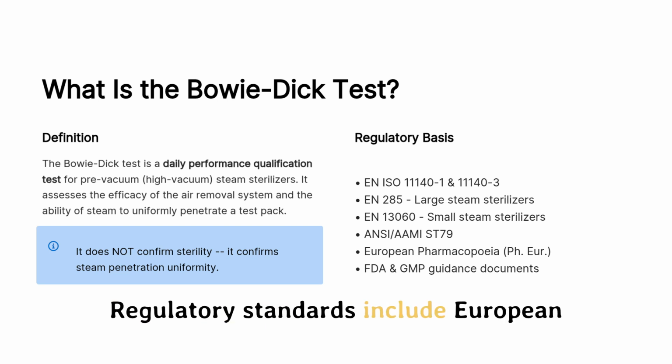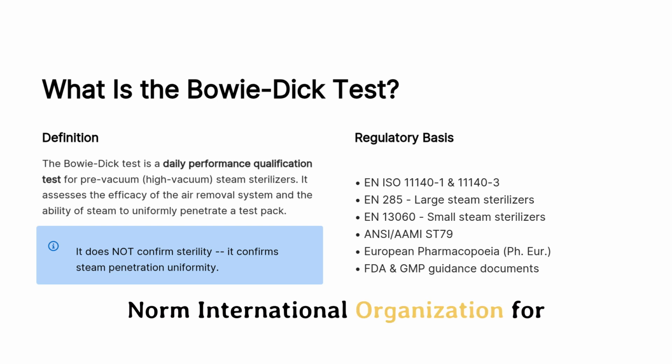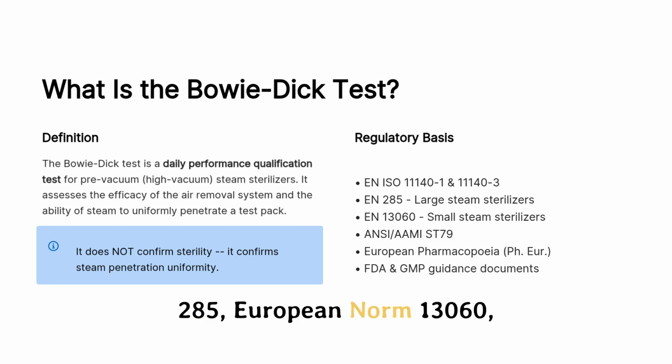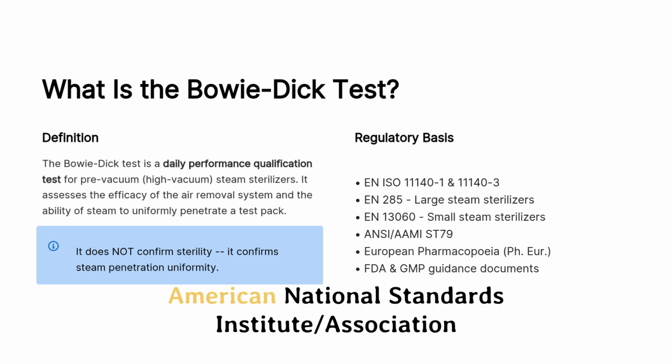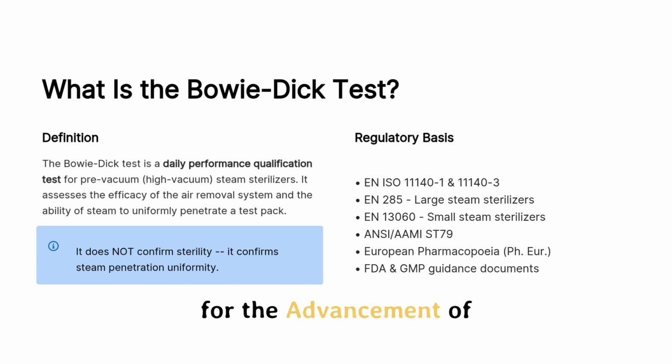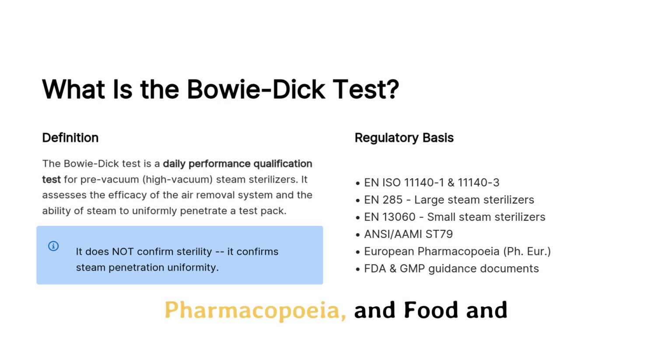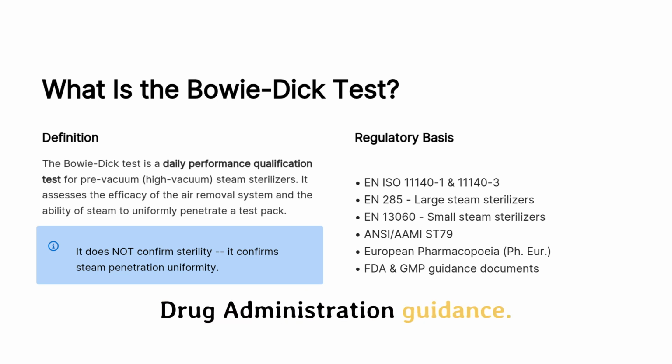Regulatory standards include European Norm International Organization for Standardization 11140-1, European Norm 285, European Norm 13060, American National Standards Institute or Association for the Advancement of Medical Instrumentation ST79, European Pharmacopoeia, and Food and Drug Administration guidance.